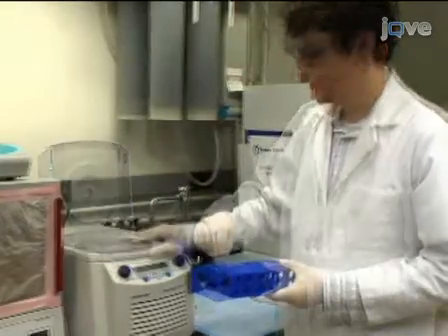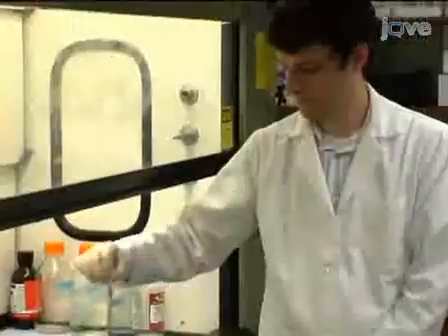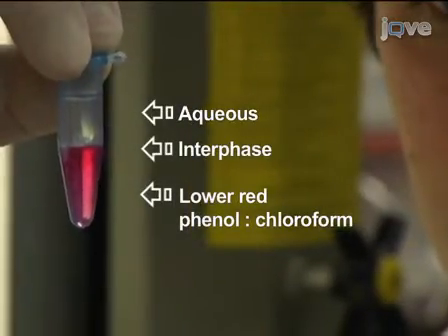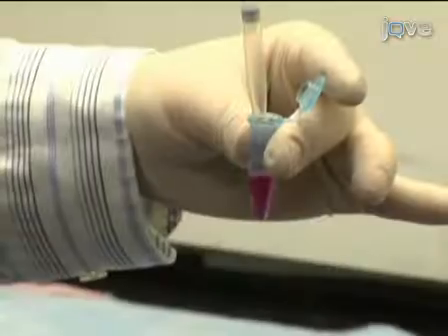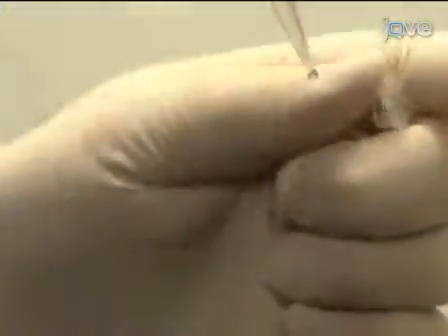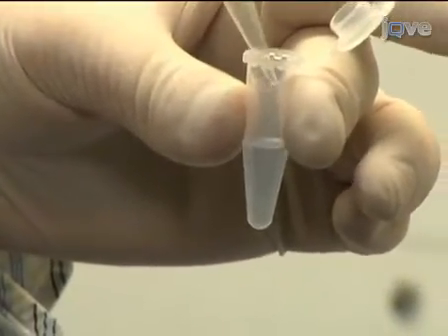The mixture will separate into a lower red phenol-chloroform phase, an interphase, and a colorless upper aqueous phase. The top layer is approximately 0.6 milliliters and it contains the RNA. Transfer the entire top aqueous layer, approximately 0.6 milliliters, into a new microfuge tube, being careful not to transfer any of the interphase layer.